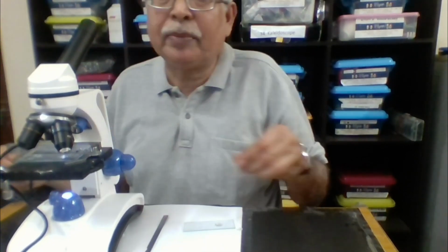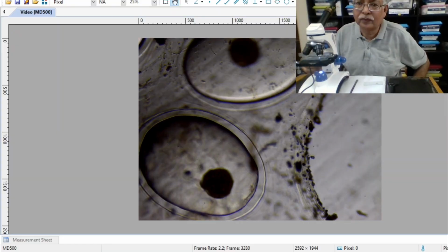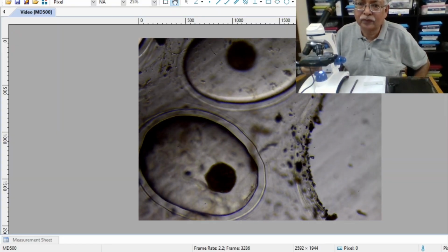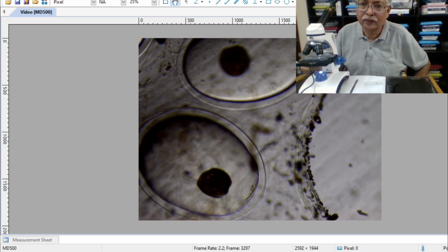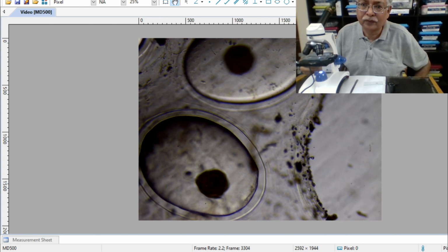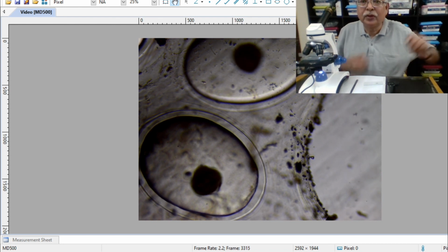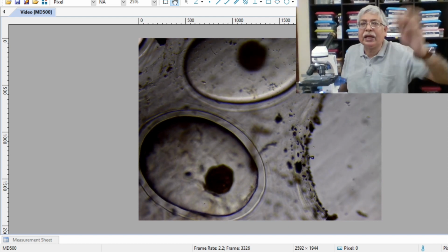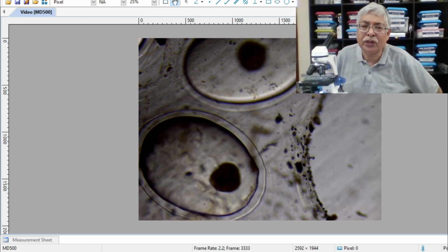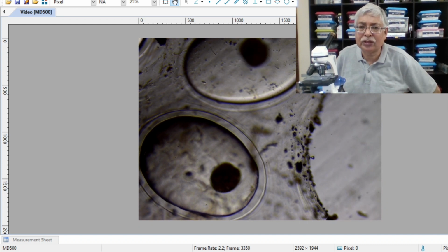Yeah, this is smaller but it's moving. So let's see this. You will have a fair idea. Here the embryo may have grown a little more, so that we can see that they started moving. Initially the embryo which was laid was not moving. Now it started moving. So it's growing bigger.